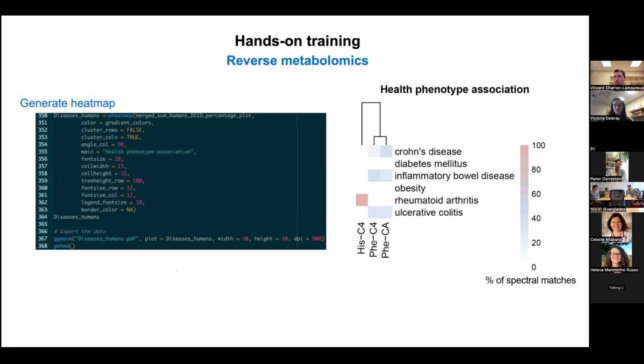And then you have to actually go into the data and do peak area deconvolution. Hopefully there's enough metadata there saying there are healthy controls, there's this health condition, or this organ versus that organ, so that you will be able to do statistics on it. And that's exactly what we did in the first 2 papers that are published.